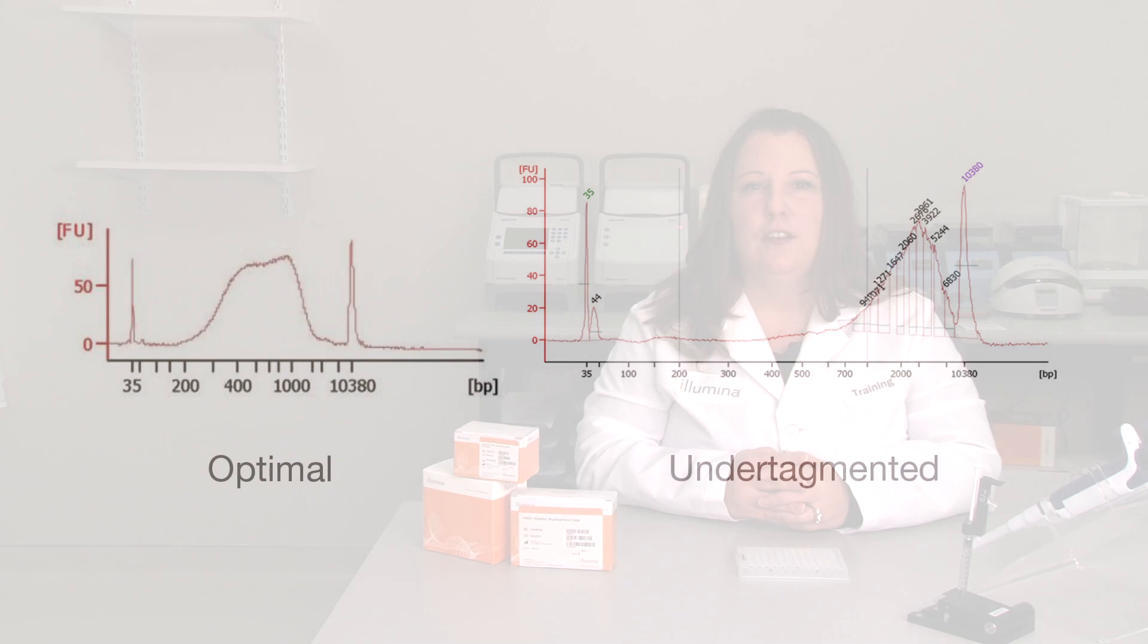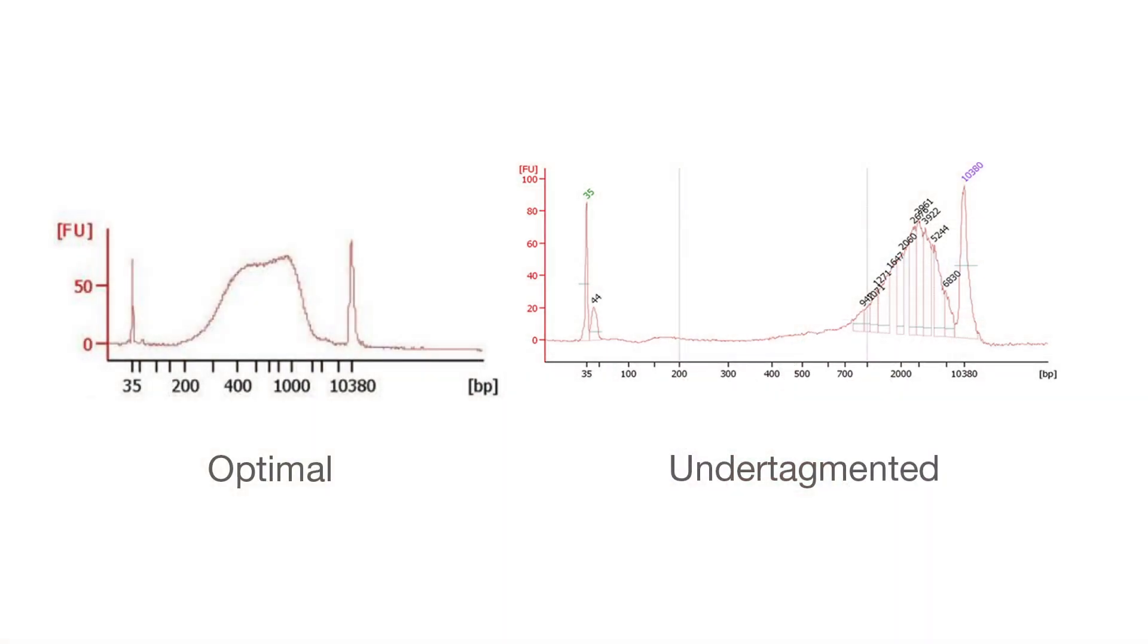So why is this optimal size so important? Libraries larger than about 1 kilobase cluster inefficiently on the flow cell, leading to lower than expected cluster densities. Lower cluster density results in lower output and can increase your overall sequencing costs.